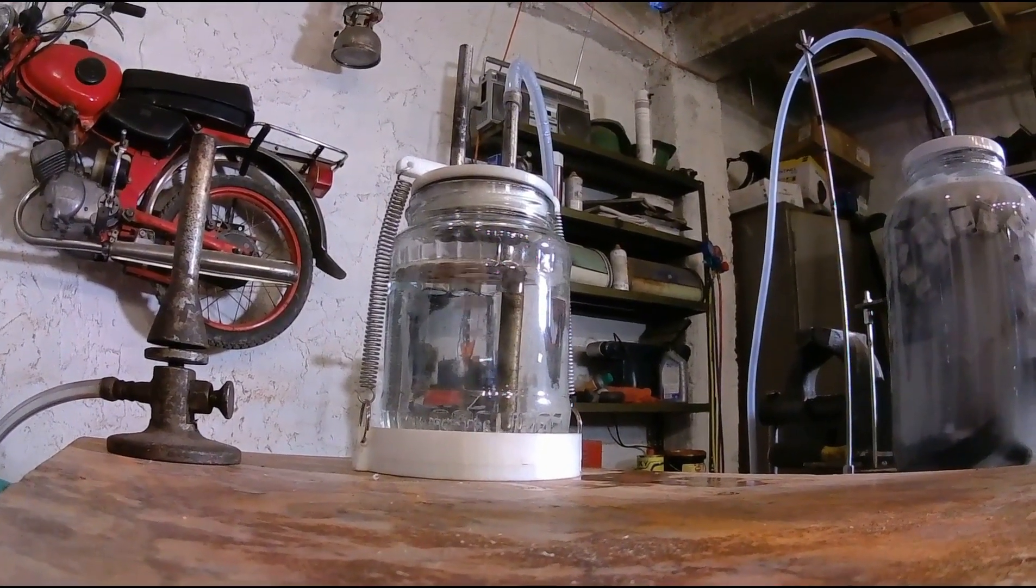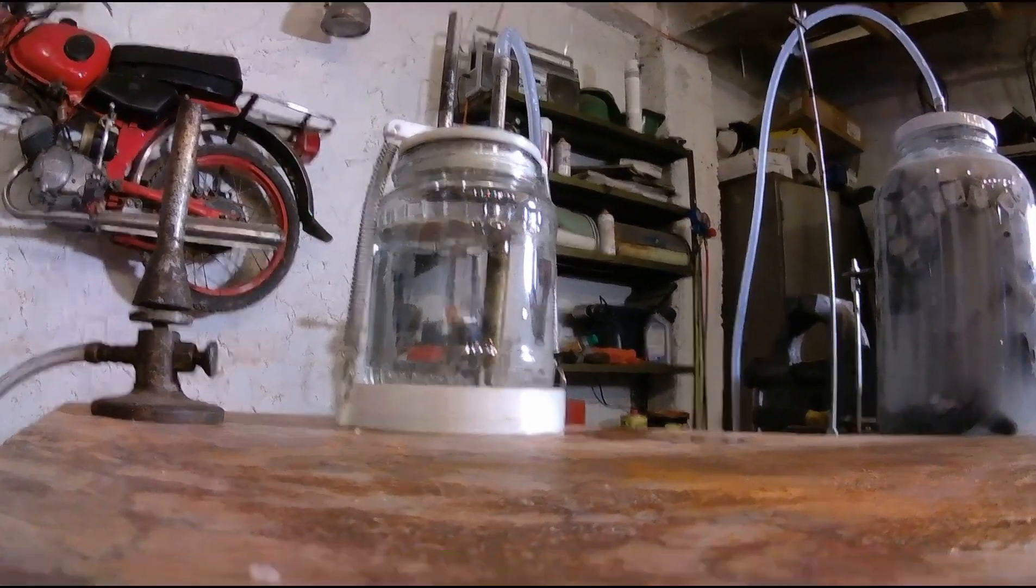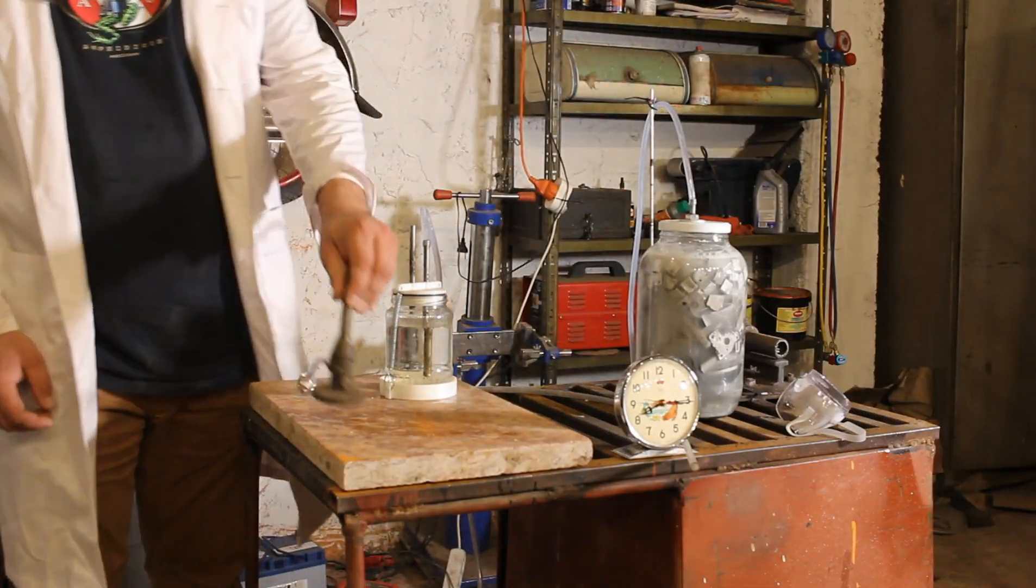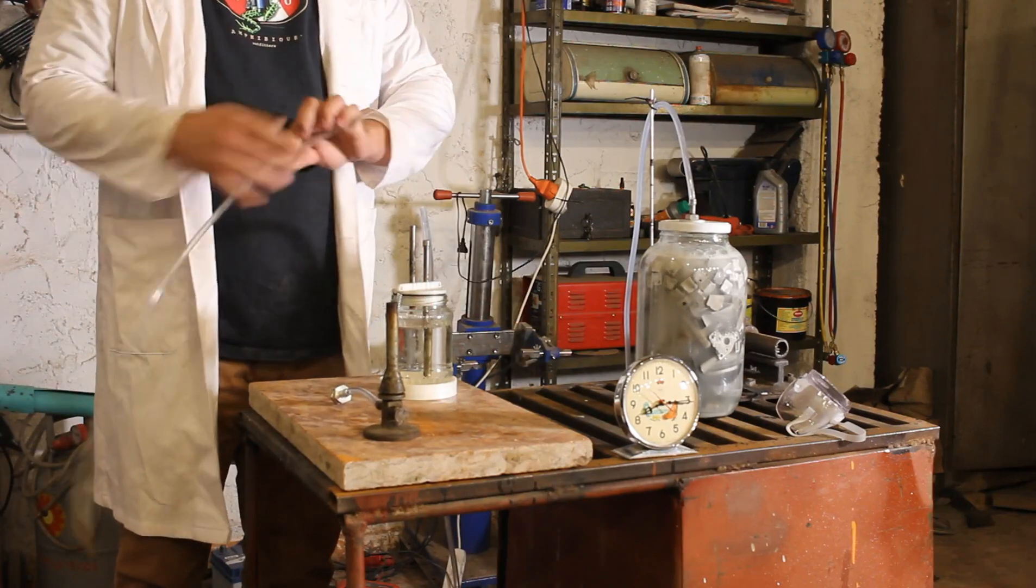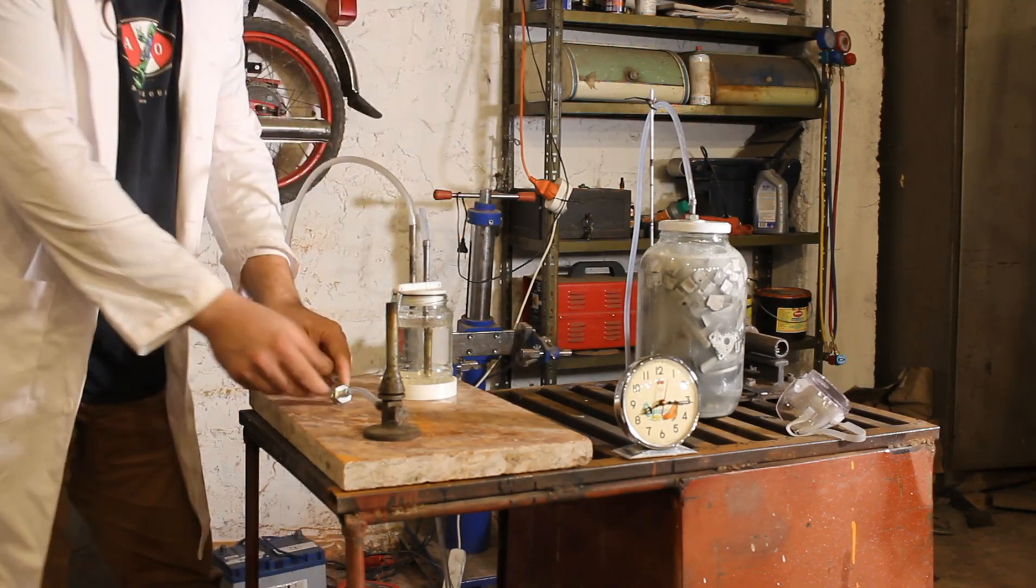This is a close-up view of the bubbler. As you may see hydrogen bubbles are clearly forming. Now it's time to connect the Bunsen burner and the one-way valve. With these pieces in place our setup should be complete.